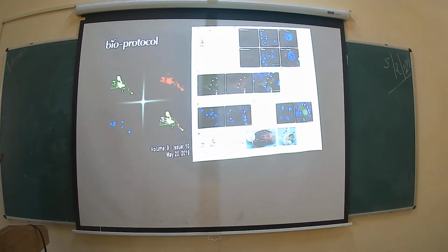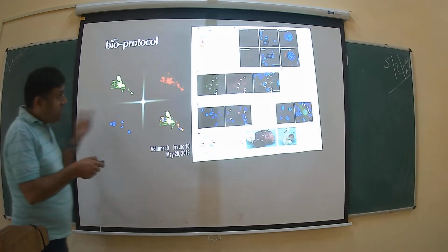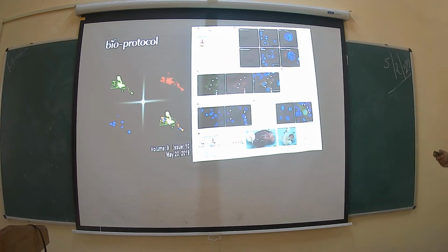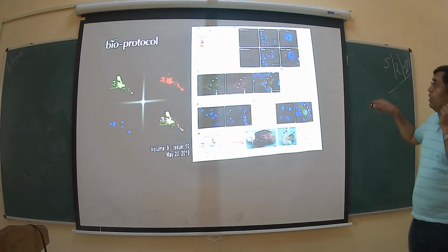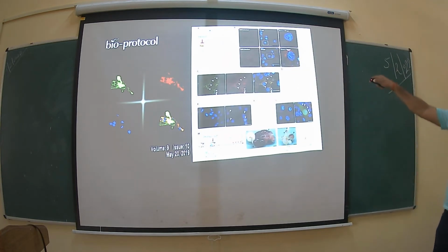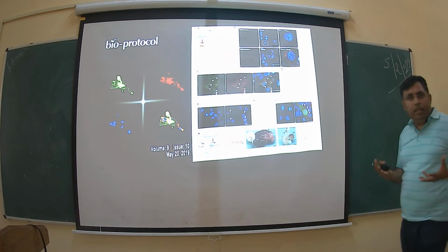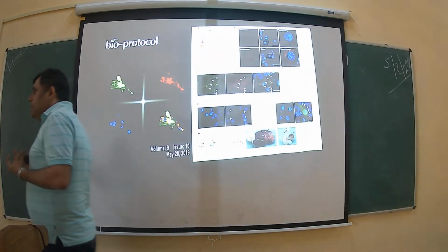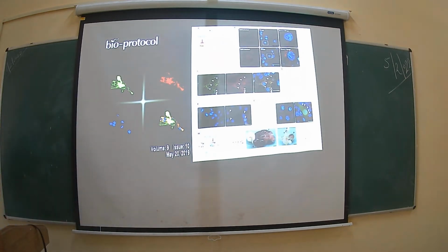This is my picture, and you can also see another picture of mine using not a fluorescent microscope but confocal microscopy, where I am showing that some kind of protein is found near the nucleus. All these pictures that you are looking at use the fluorescence phenomenon, which increases the impact of your finding, where you can produce a direct visualization of these cells.